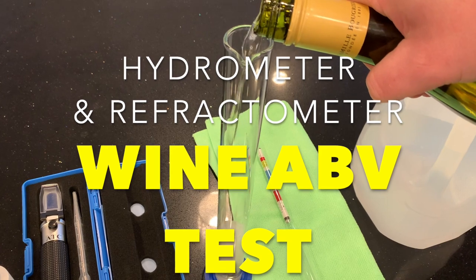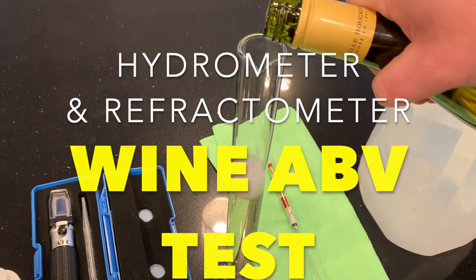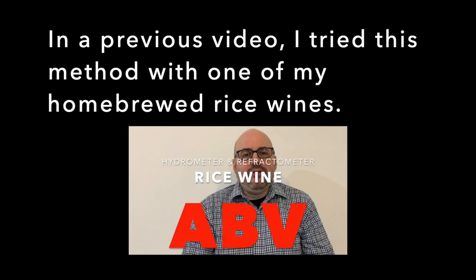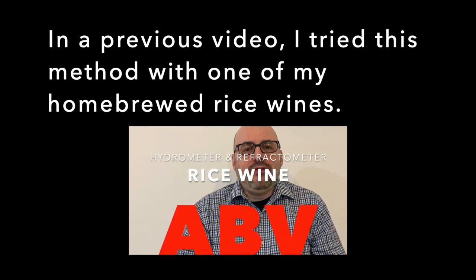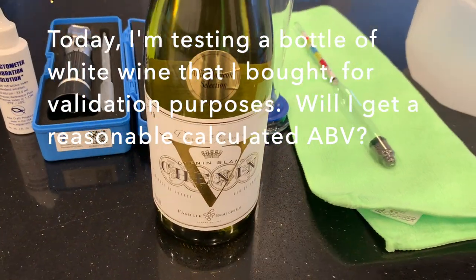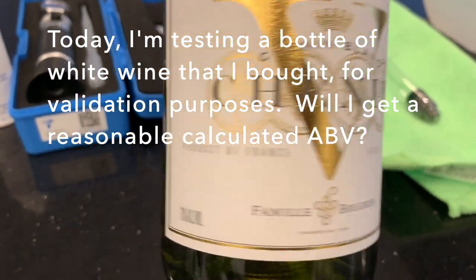Hello viewers, this is a hydrometer and refractometer wine ABV test. Today I'm retesting the hydrometer and refractometer method for determining the alcohol content of wine. In a previous video I tried this method with one of my home-brewed rice wines, but I wasn't too sure about my results. So today I'm testing a bottle of white wine that I bought for validation purposes. Will I get a reasonable calculated ABV?